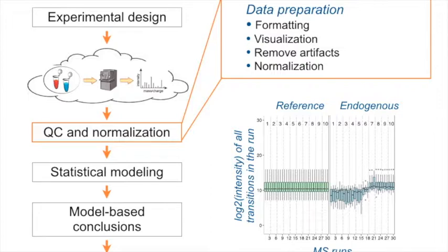Not really, because I can normalize every value to the same number, and I will have a coefficient of variation of 0. But it doesn't mean that it's a good normalization, right? You can totally overcorrect the true variation, and it will look like, oh yeah, it's very stable. What you can do is look at the coefficient of variation separately within each group and things like that. But again, your normalization can overcorrect some of the changes as well. So our approach is to do as little to the data as possible.